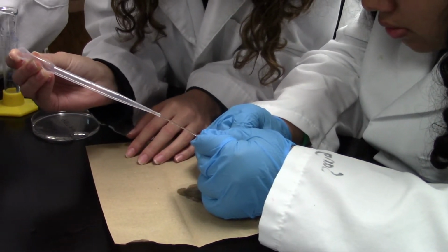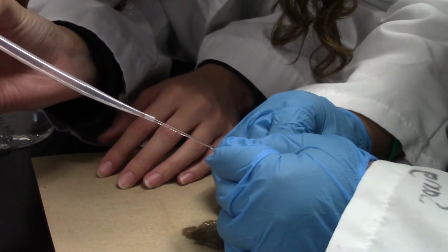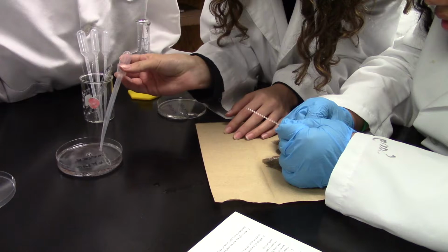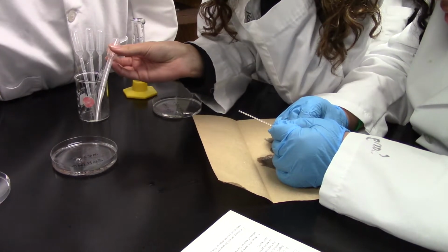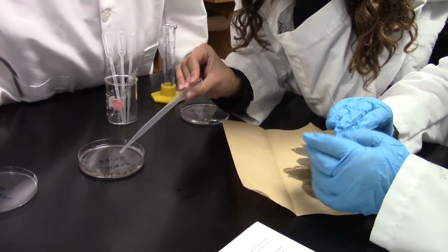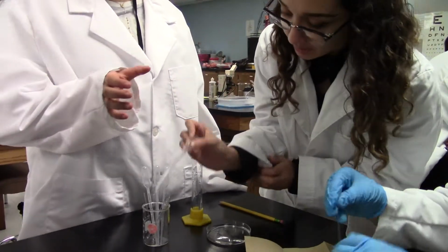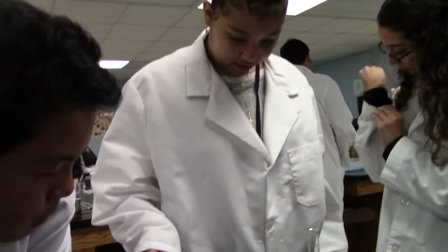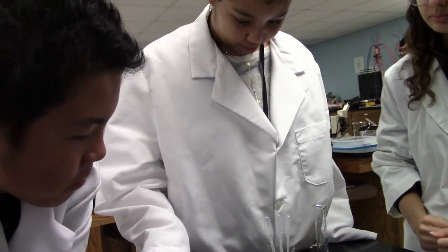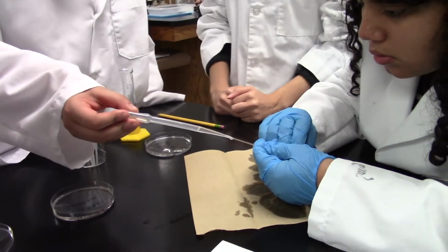Okay, turn on the microscope, the stage, the white, the lowest. Smaller one. Have you counted it? Mom, we're squishing him. Oh, don't tell me he's stuck. No, you have to count it. Okay, can go back out. Still in there. Okay. Can you get him like half out? Here, you want to try this one? Yeah. Okay, I'm going to try getting this one. Squirt out this water here. You just gotta move the capillary tube.